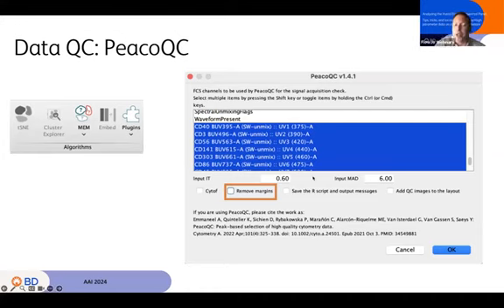It asks you which parameters you would like to use. Typically, it's all of them. There are a couple of isolation tree tunables, and how many median absolute deviations you need to be away to get parsed from the data. There are defaults typed in there, in the paper, listed right here. The authors go to some lengths explaining why these are the defaults that they recommend. They seem good. I don't ever change them myself. I feel like you can just run them from there.